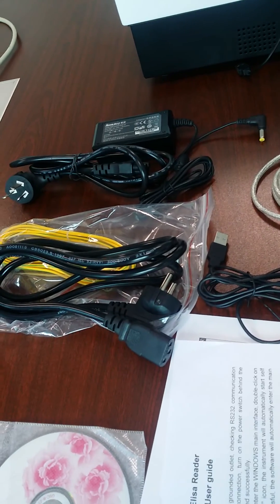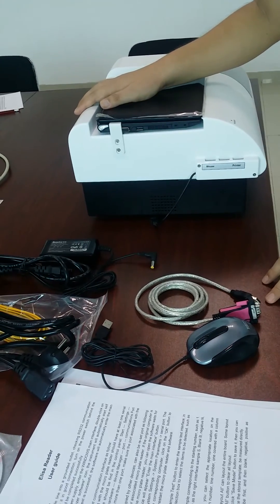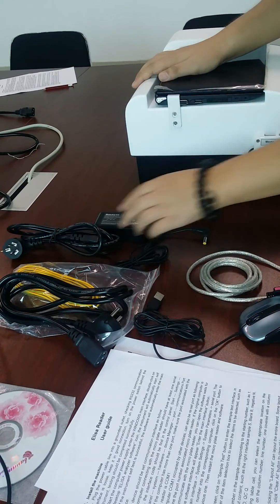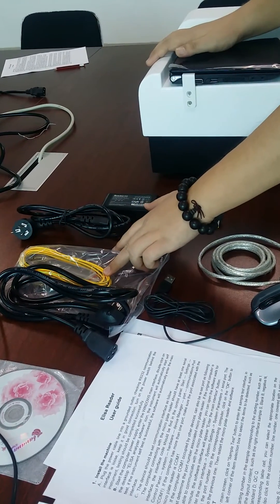Then you will find some spare parts. First is the software, and some spare parts for connecting the computer with the machine: the mouse, the RS232 cables, the cables for the computers, and the power for the computers. This cable is for the machine, and this line is to connect to the grounding.